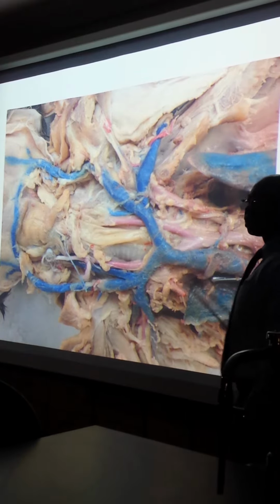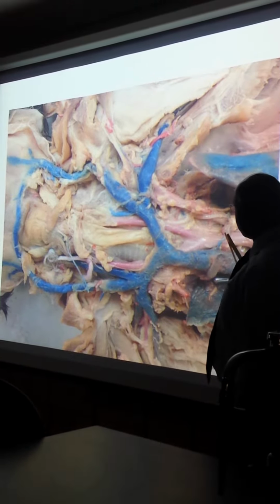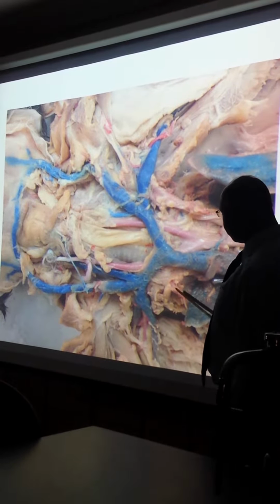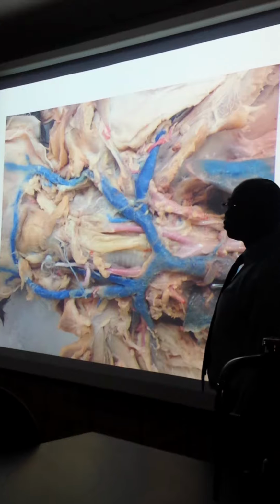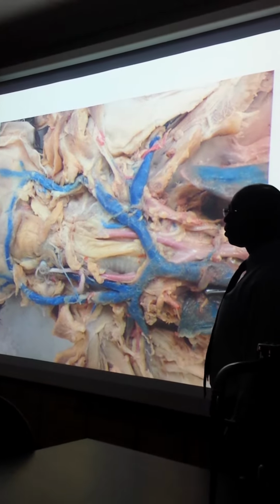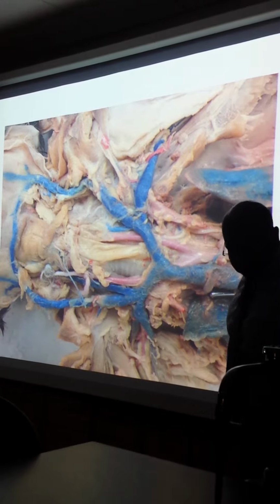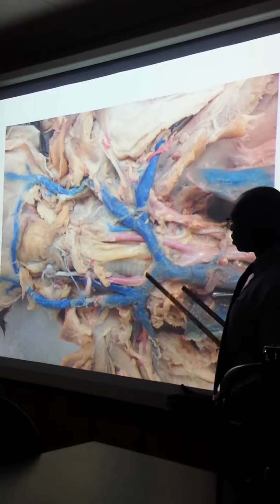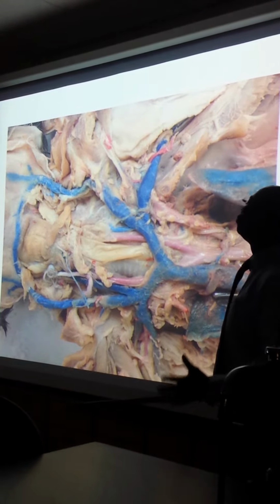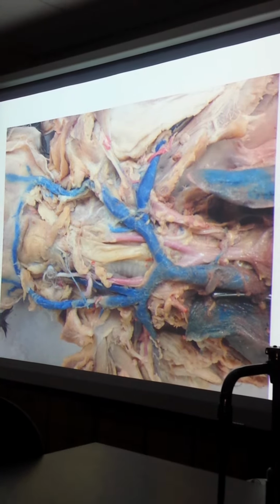And you could see this, like the internal mammary, and of course the vein and arteries. You can see them nicely on these diagrams in that one that I gave you. I think the one with the list, I think. Yeah, anyway. But you look at those handouts for some of the other ones that are not very obvious on the cat, because I still kind of need you to know the approximate location of those blood vessels, okay? All right, so very good.